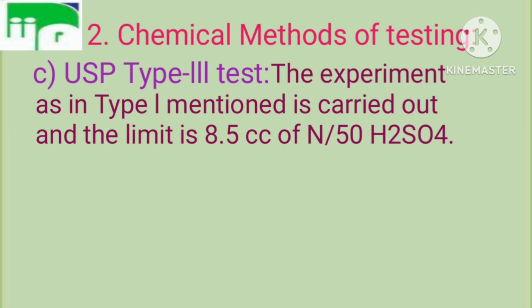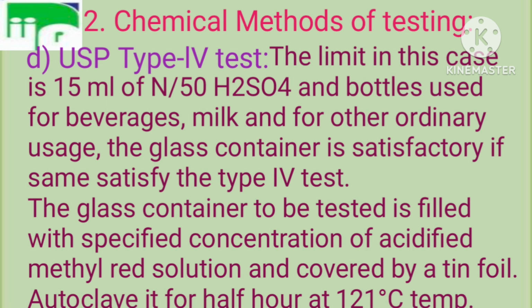USP type 3 test. The experiment as in type 1 mentioned is carried out and the limit is 8.5 cc of N/50 H2SO4. USP type 4 test. The limit in this case is 15 ml of N/50 H2SO4 and it is for bottles used for beverages, milk and for other ordinary uses.